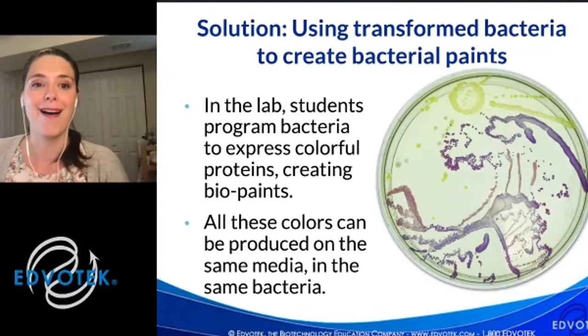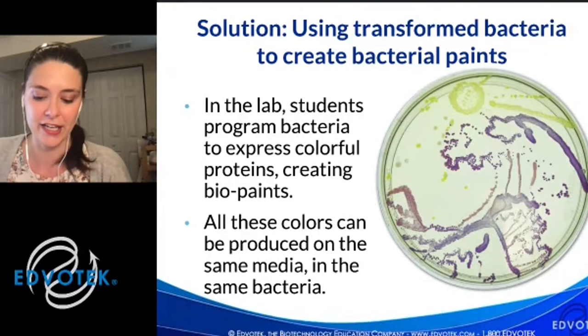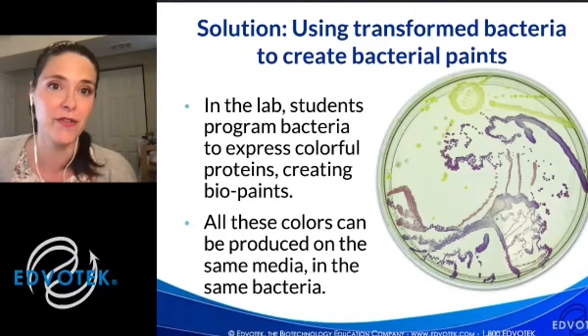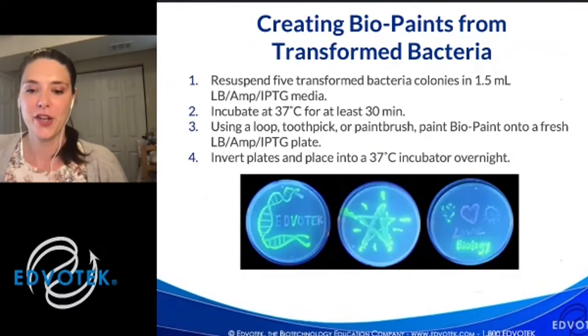So this is one that was produced by one of the people in our lab. It's a wave with a sun, and these are all produced with E. coli expressing chromogenic proteins. And the yellow-green color here is actually GFP. It's an overexpression of GFP. And oftentimes, we can see that as a yellow-green color on the plates. And so we can use it both as a fluorescent color and as a visible color. So this is what you want to get to, actually creating the art.